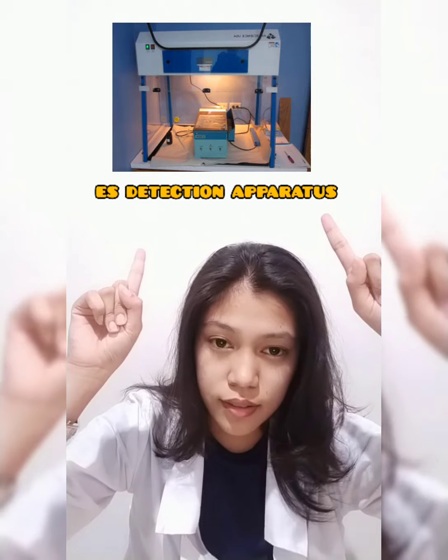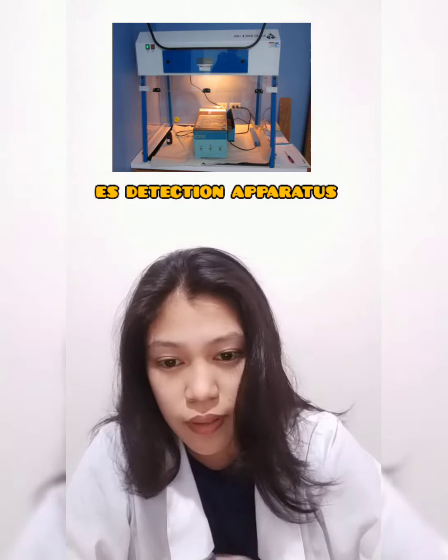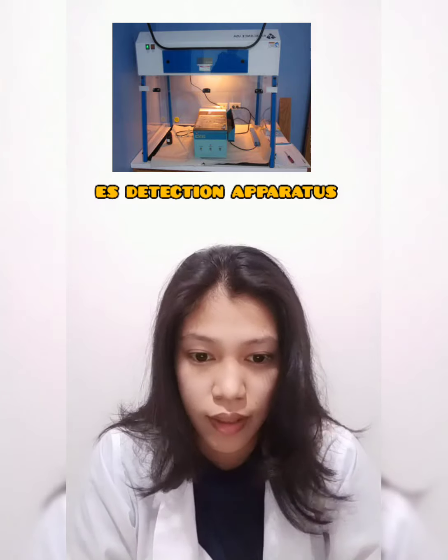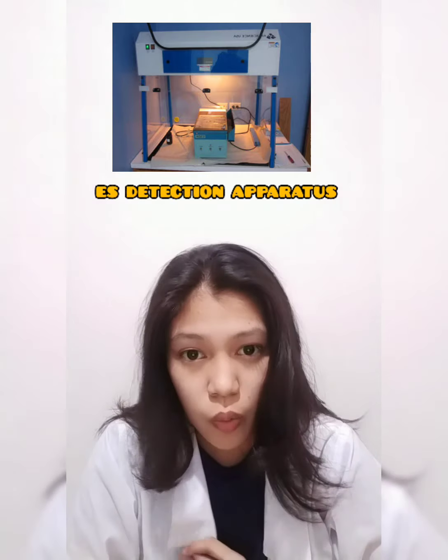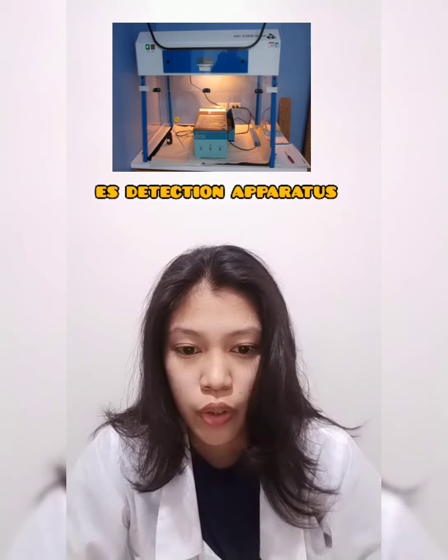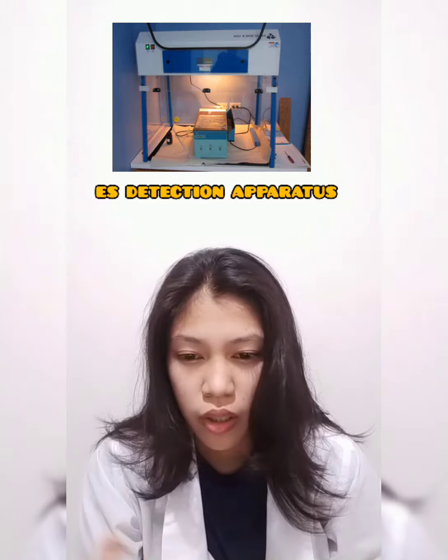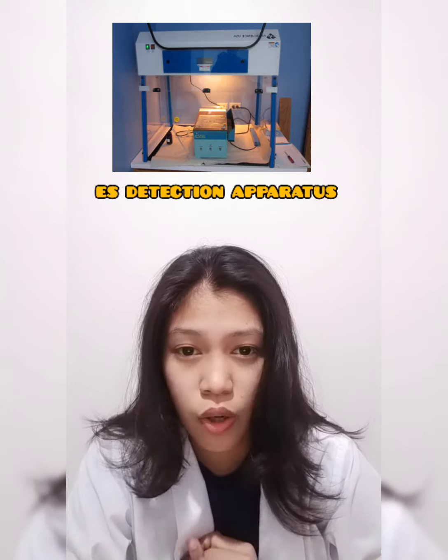The first instrument is the electrostatic detection apparatus. An electrostatic detection device, EDD or ESDA, is a specialized piece of equipment commonly used in questioned document examination to reveal indentations or impressions in paper that may otherwise go unnoticed.